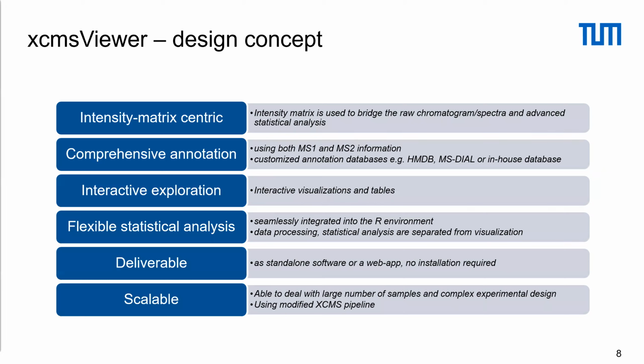XCMS Viewer is a collection of R packages, and it can be used to process, analyze, and also visualize the result. It is based on the XCMS package, which is a very well implemented package by Smith and coworkers many years ago. But with XCMS Viewer, we greatly extended its functionality and particularly focus on interactive exploration. So it has some unique features, from my point of view.